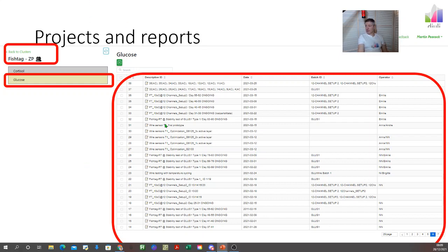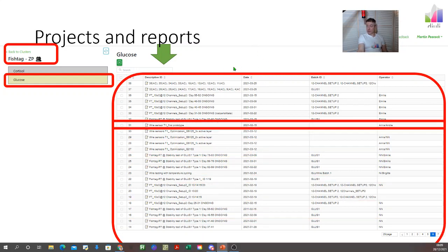But really importantly as well, this flat list, which by the way goes on for several pages, is searchable. So you can search on keywords and start finding, let's say, lost data from two years ago. It's important because as the experimental owner, you want to know where your data is, and you want to be able to find material within that data. So it's important that we have a searchable option.